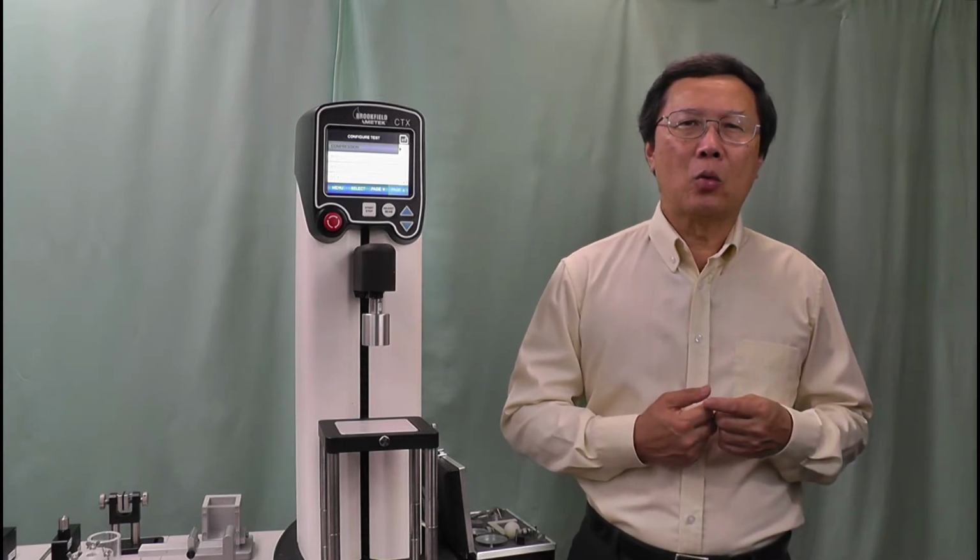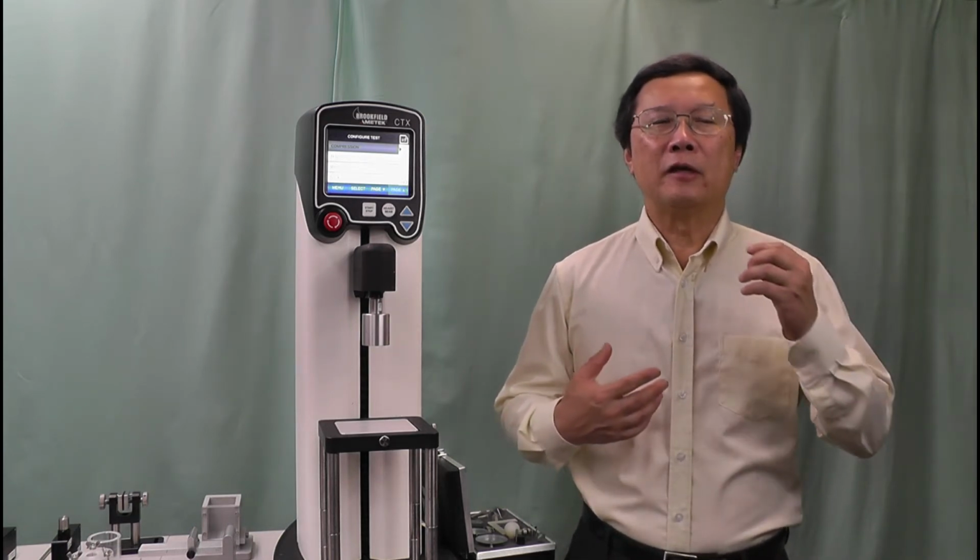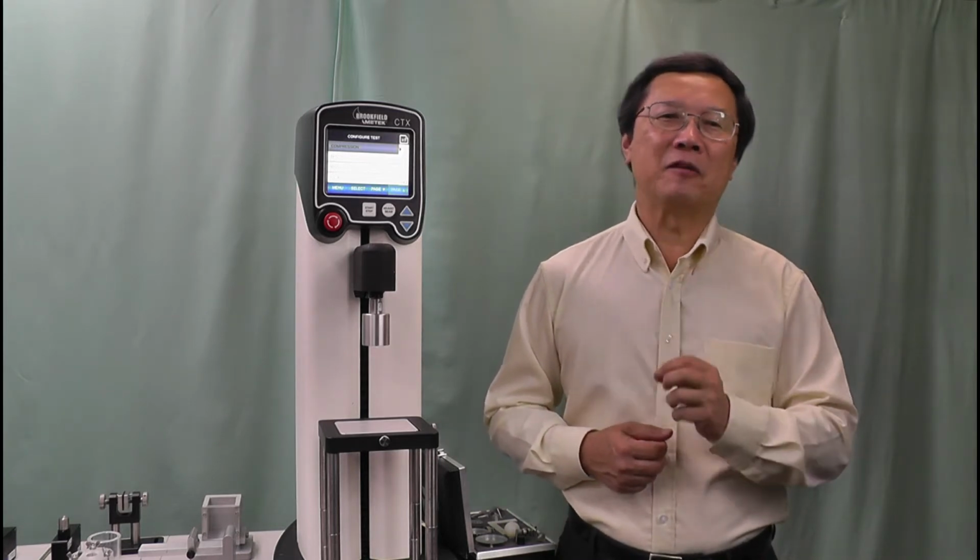What are the factors affecting texture measurement? What are those when they want to write a test method? What are the things that they can look out for? So there are two main things that you have to consider: the instrument-specific variables and the sample-specific variables. Now for this video, I'm going to talk about instrument-specific variables.